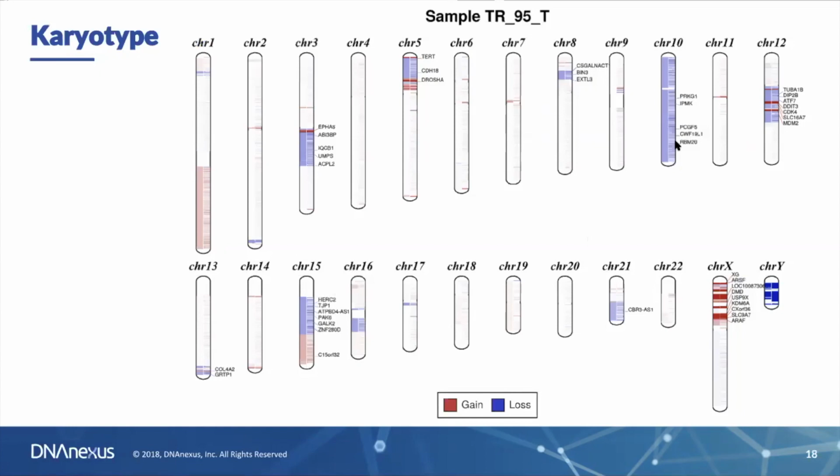Sample 95 that I mentioned as the most interesting case. We're looking at chromosome 12. We see that single copy loss with gene amplifications at 3 points. We can follow the gene labels to those points on the plot, and I see CDK4 and MDM2. I know those are oncogenes, so I'm going to take a closer look at those.